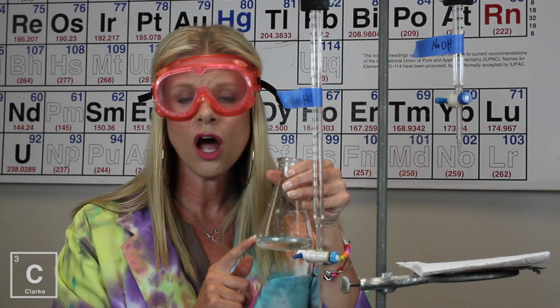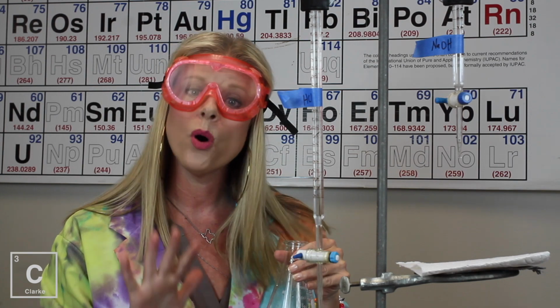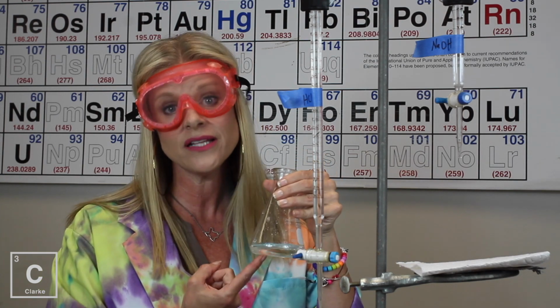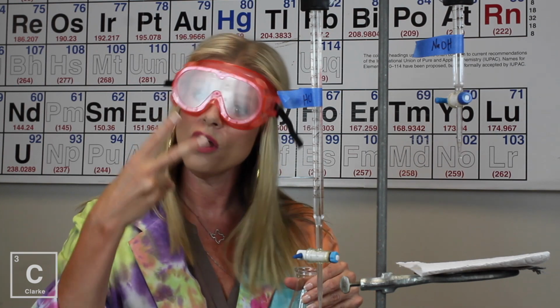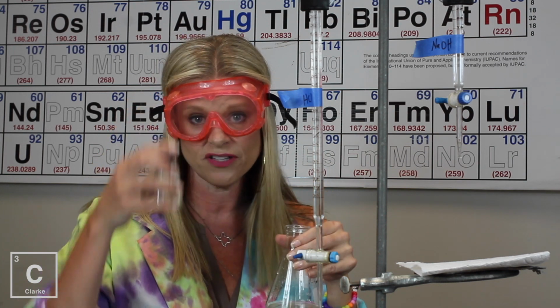I have my known concentration of acid in this flask. I'm using 0.1 molar hydrochloric acid, and I have 10 milliliters in here. So we're going into this process knowing two things. I know the molarity, the concentration of the acid. I also know the volume of the acid. Now, to my acid, I am going to add a couple of drops of phenolphthalein.